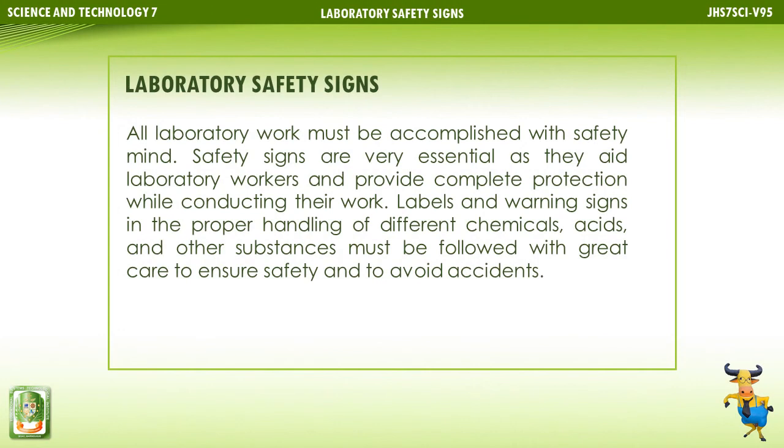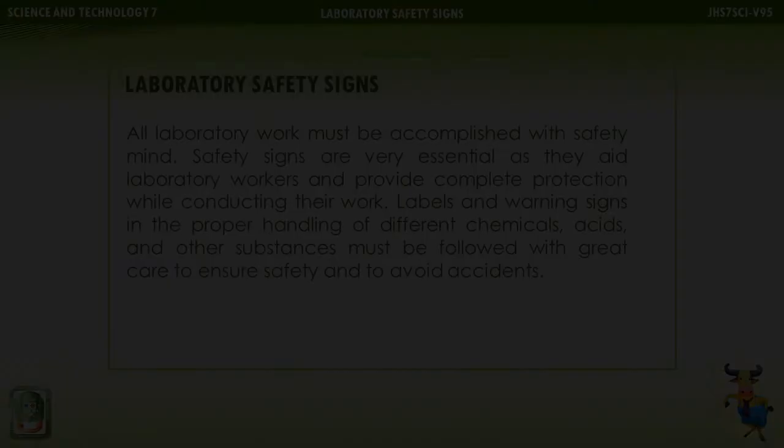Laboratory safety signs. All laboratory work must be accomplished with safety in mind. Safety signs are very essential as they aid laboratory workers, and provide complete protection while conducting their work. Labels and warning signs in the proper handling of different chemicals, acids, and other substances must be followed with great care, to ensure safety and to avoid accidents.